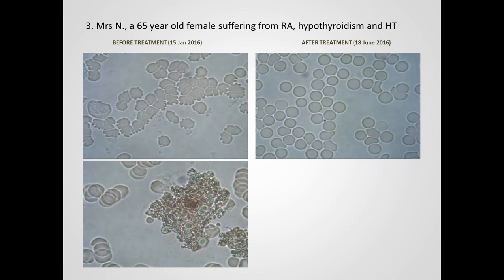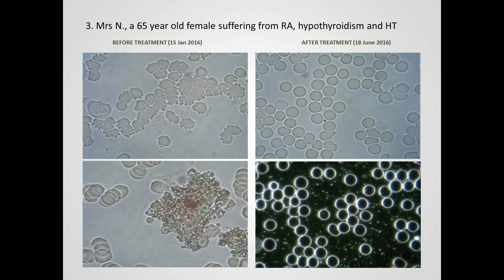We usually would see these crystals very clearly in the sample. And again, with these structures, we compare the size of them to the size of red blood cells. And you can see that this crystal is very large compared to the red blood cell. All right, and just a dark field example on the right-hand side, showing that there's a great degree of improvement. We were not actually able to see any uric acid crystal during the follow-up.